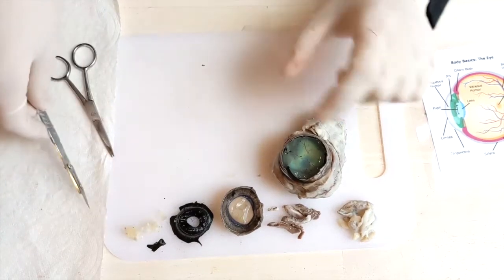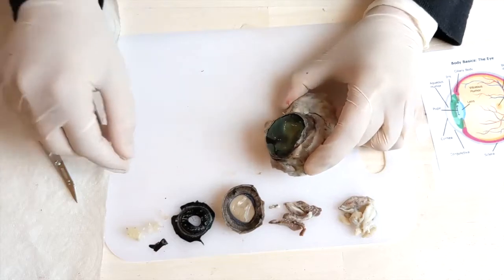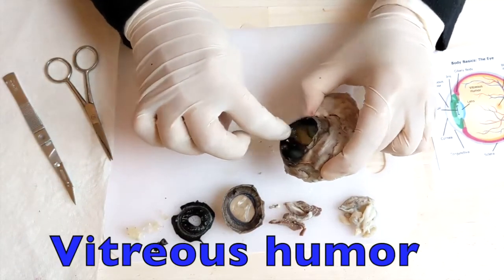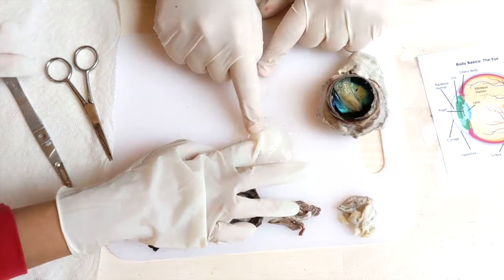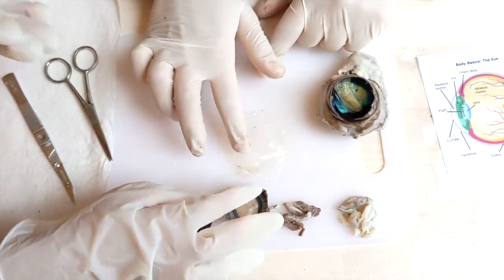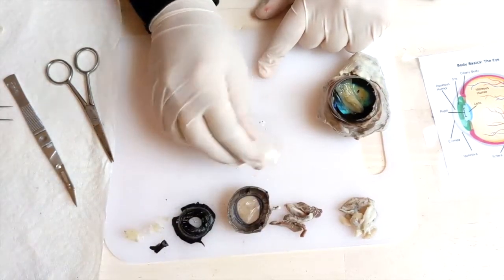Okay, now we're going to talk about the funnest part of the eye, which is the jelly stuff. This is called the vitreous humor. Yeah, that jellyish stuff. It's made up of protein and water, and that's what gives it that jellyish structure.